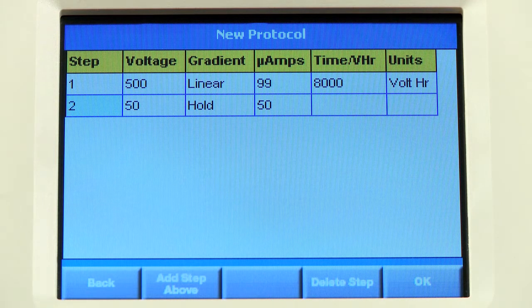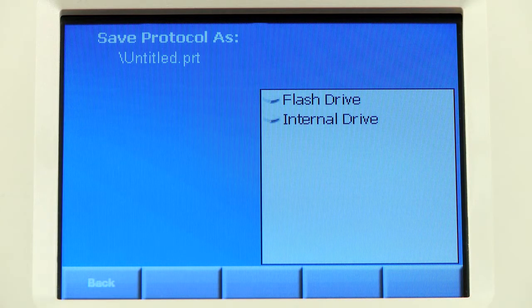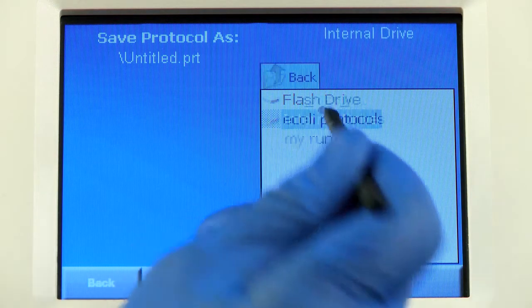Once you are satisfied, press OK and navigate to the location where you would like to store the protocol.